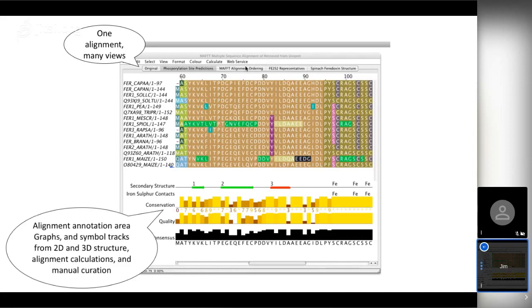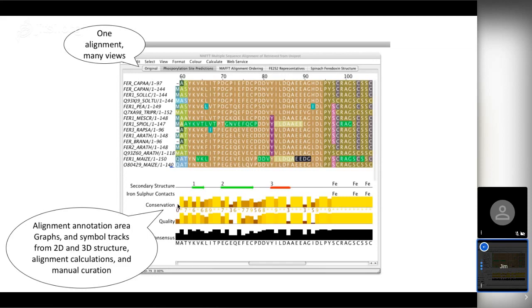The multiple sequence alignment program shuffles amino acids around until it maximizes the score for common columns. There are a few different tabs, so you can have different visualizations of the same sequence alignment, showing different types of information on the same alignment. Jalview also has built-in analysis routines that produce scores at the bottom of the alignment — in this case, conservation, which is amino acid physical chemical property conservation. Some amino acids have got similar chemical properties, others have very different. Some have hydrophobic greasy side chains, others are hydrophilic and found on the surface of proteins rather than inside.